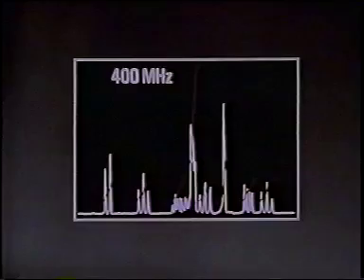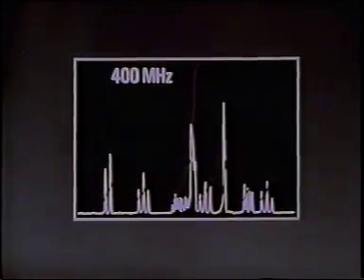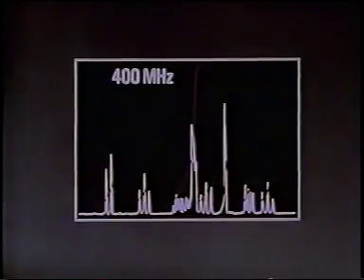From a complex second-order 60 MHz spectrum, we've moved to a much simpler 400 MHz spectrum that's nearly first order. Without worrying about precise interpretations, you'll be able to recognize familiar and interpretable patterns like a singlet, a doublet, and a doublet of doublets, for example.